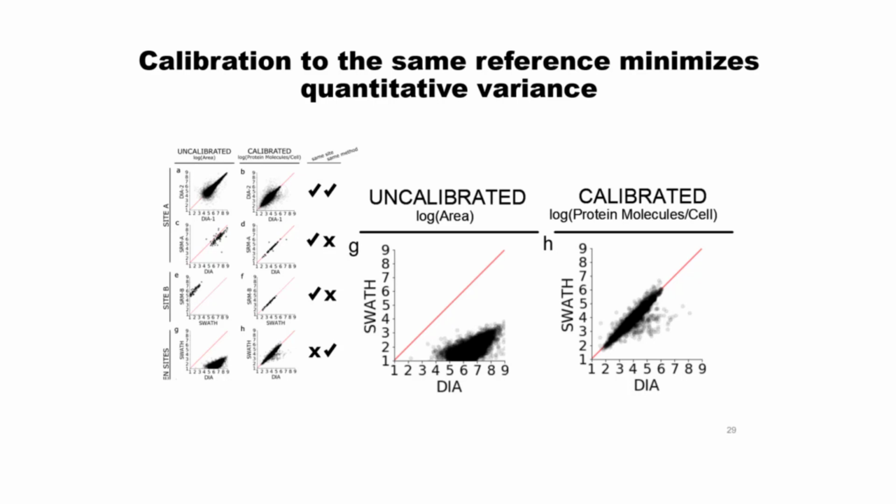Yeah. So I do want to make a point, though, because you said spike in. Yeah, it's a spike in. That's right. It's not spiking in anything. In fact, that wouldn't work. This is an external single point reference calibrator. Basically, if you had a spike in, this probably would be better, right? No, it has to be external. This is an external calibrant. We're calibrating this thing to an external single point calibrator.